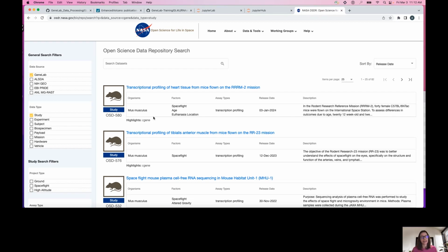So this is going to be a little bit tricky because when you pick some data sets, you'll have to go in and see if there are actually raw counts files there or not. And you'll only be able to use data sets that have those raw counts files. Yeah, I already kind of took a look at that, and I did find a couple data sets that have the stuff needed, so it's okay.